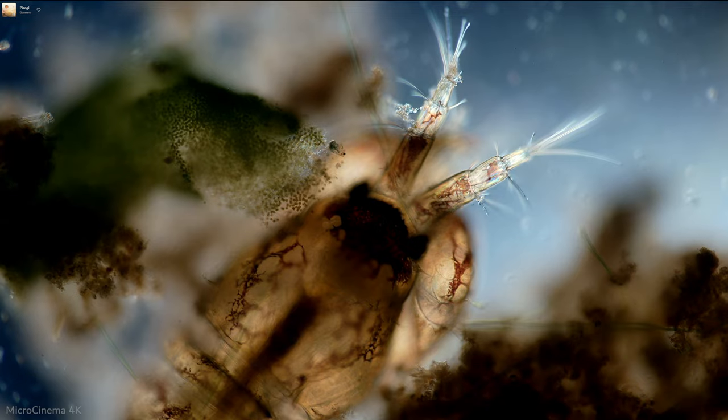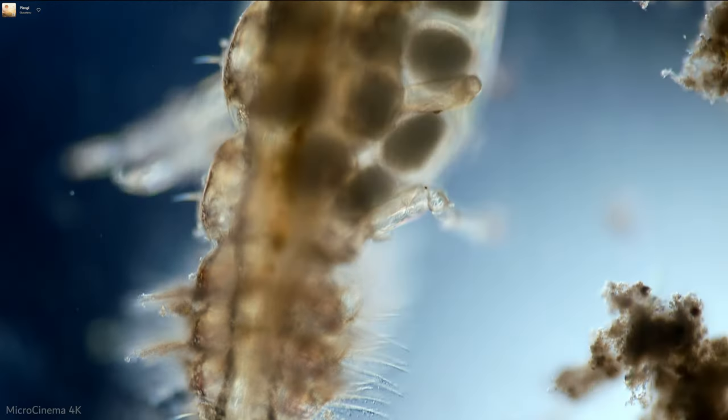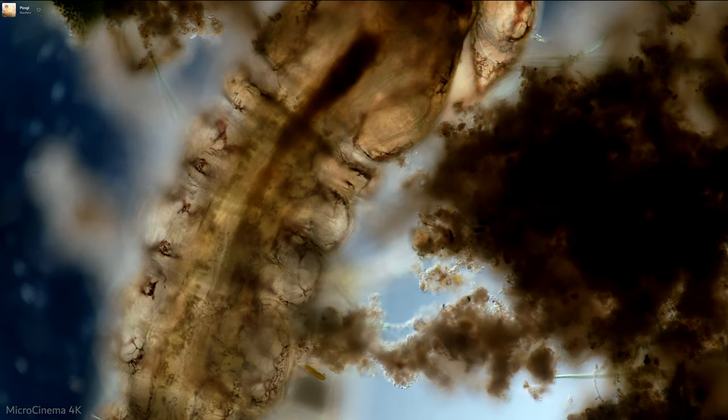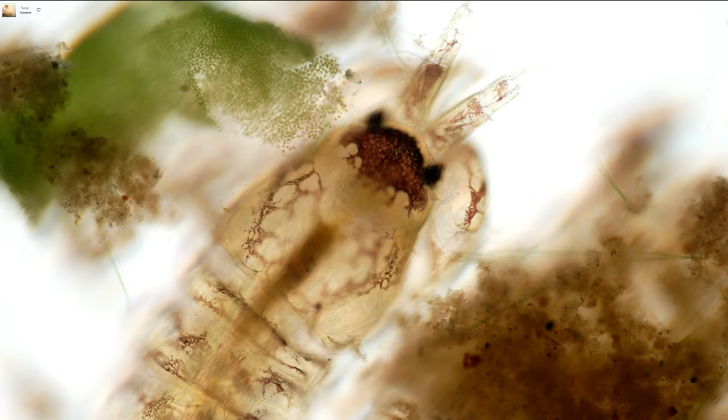So this is another one of these crazy scorpion shrimp things. And it's actually got a clutch of eggs on its belly. But unfortunately, this one also seems to have expired. It's pretty sad. Sorry, little dude, or little dudette. But we can at least check it out in polarized light.